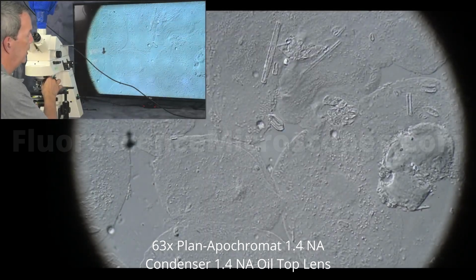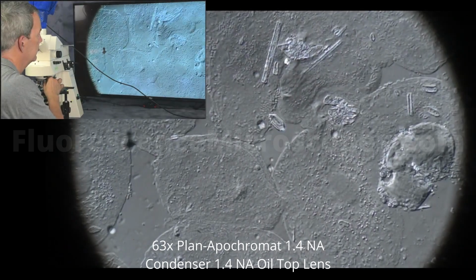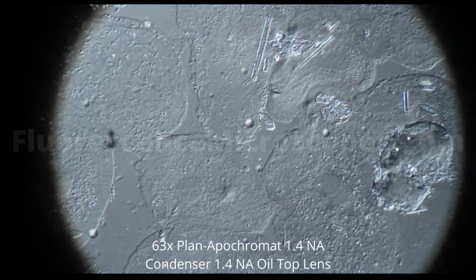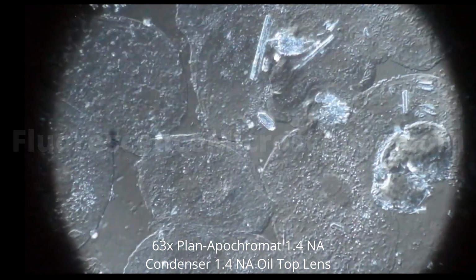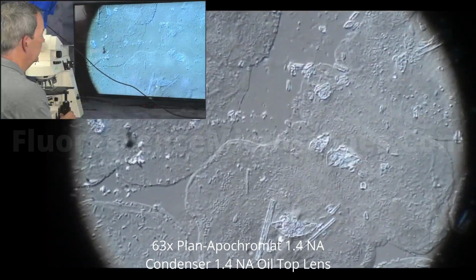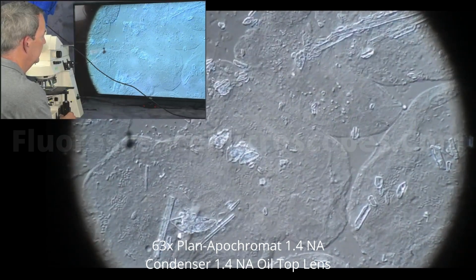So depending on how you adjust this, you can see more or less contrast. Pseudo dark field, going into a negative bias. Right about there is probably the optimal point for the negative bias, and then a positive bias right in here. And I can move the X, Y just a little bit, look around at different areas on the slide, get it in focus.